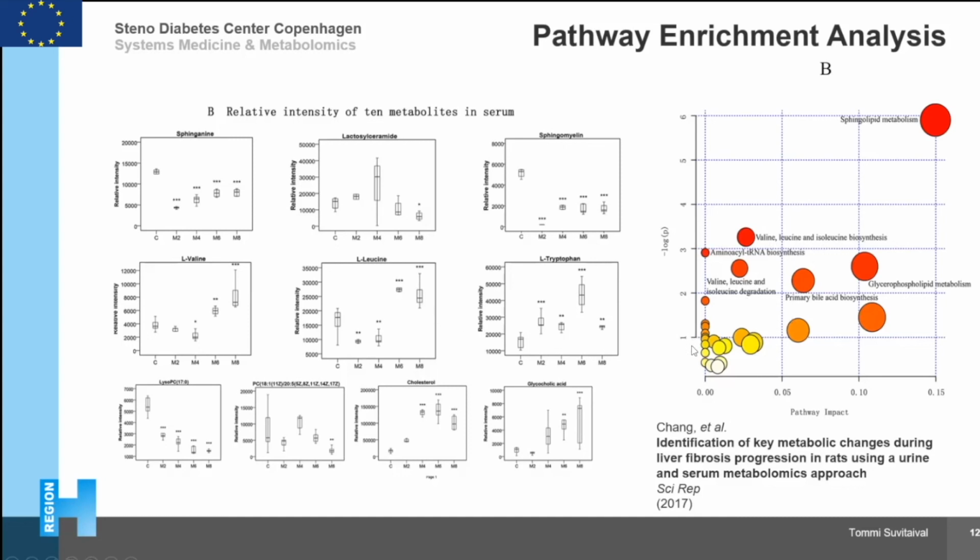And then we have a lot of pathways that are not really changed. They are just here around 0. Some individual metabolites might be changing in those two, but not really overall. And the most significant is sphingolipid metabolism, which are lipids that are changing. Here it appears to be reduced in the disease.